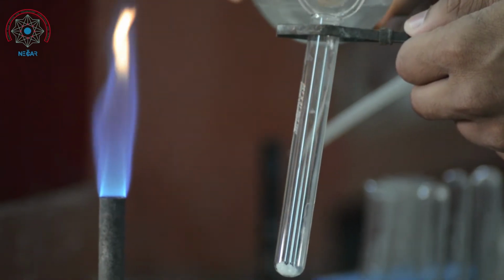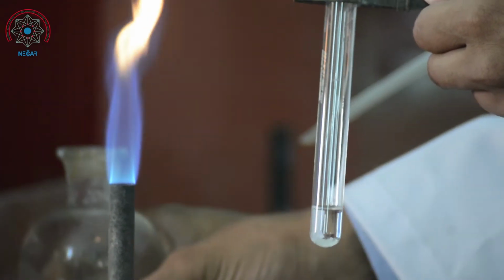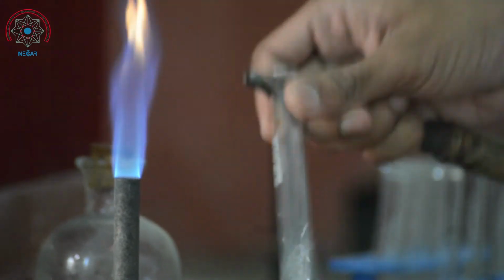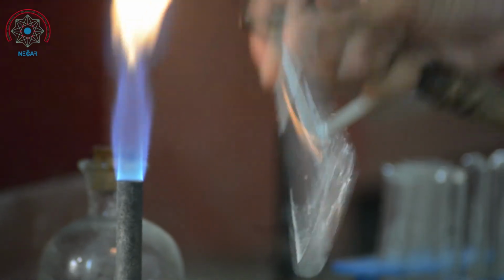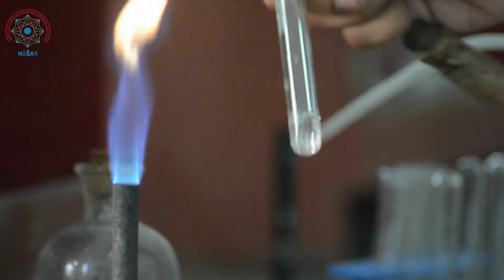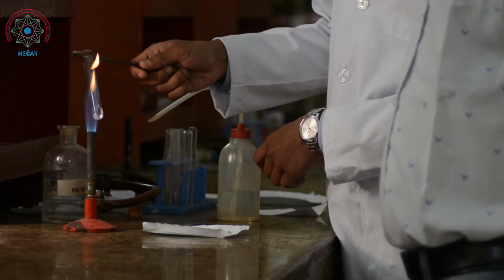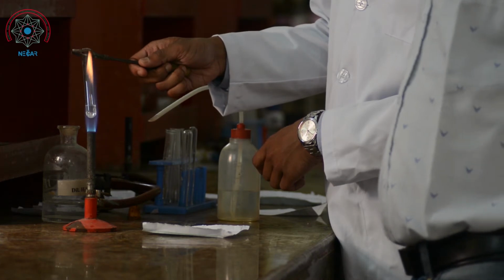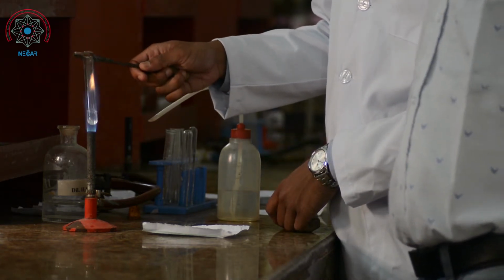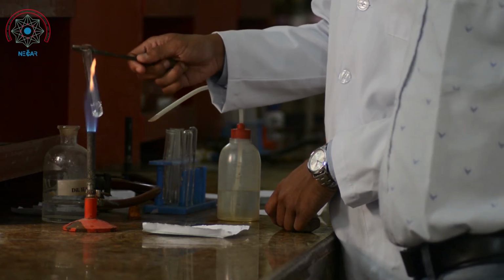While adding the dilute sulfuric acid, we carefully observe what changes happen in the test tubes. If there is no change, we can heat a little bit again on the Bunsen burner flame. In this case, we don't see any changes or evolution of gases during the addition of sulfuric acid.